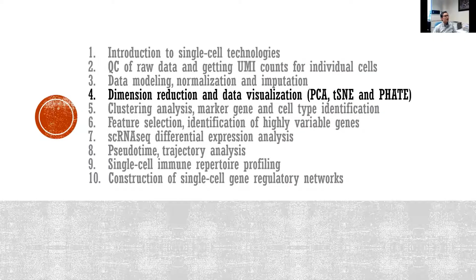Today, we are going to talk about dimension reduction and data visualization. I will introduce several dimension reduction algorithms like PCA, tSNE, and PHATE, and see how they can apply to single-cell RNA-seq data visualization.